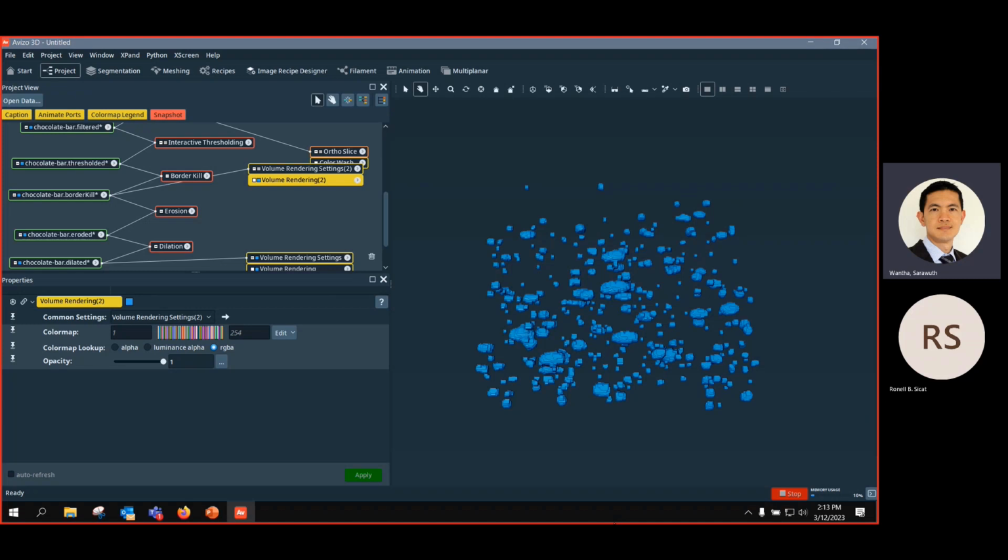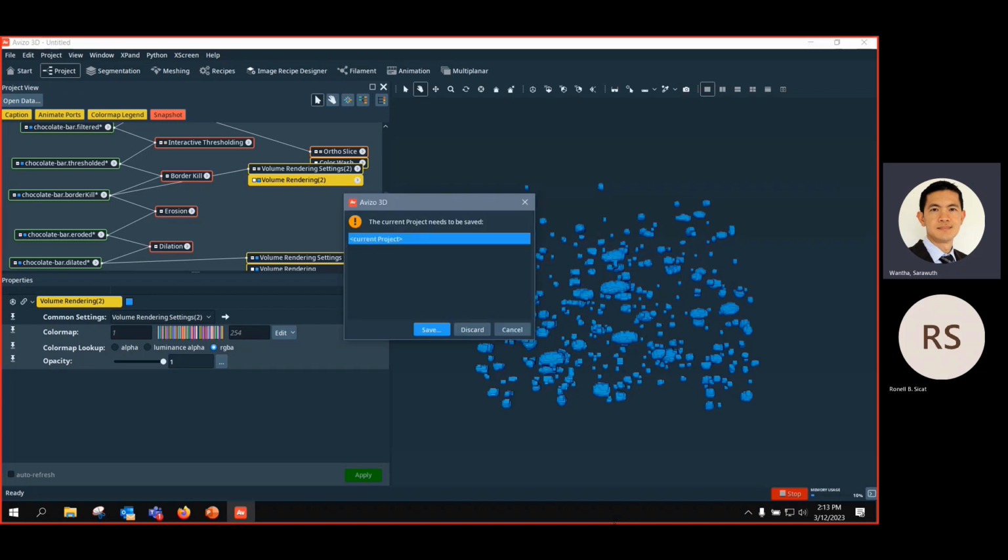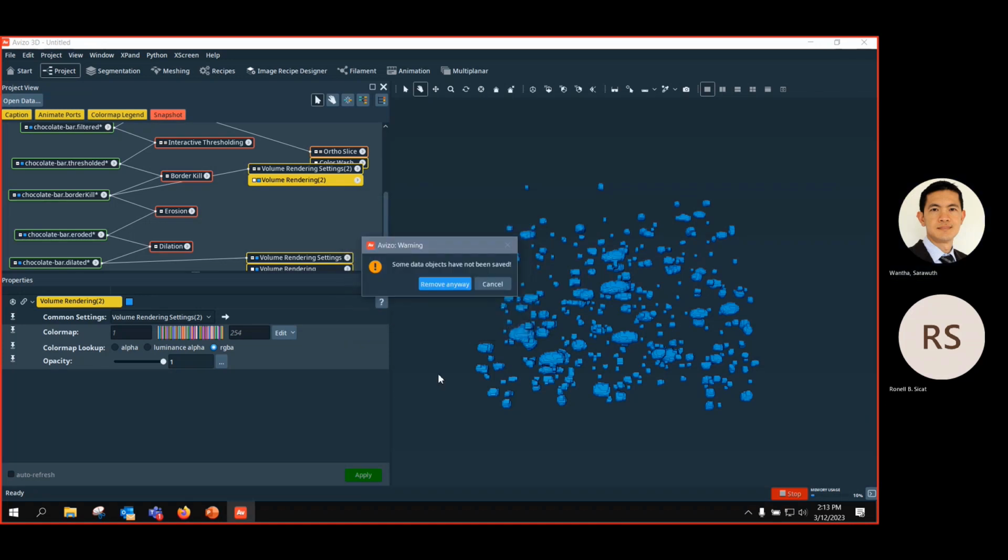Yes, for example, you have the trabecular bone that has a network structure here, and you want to separate them, but it's really difficult. Okay, I'll show this example, it's easier if you understand it.